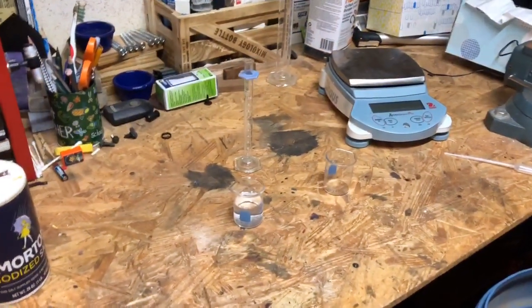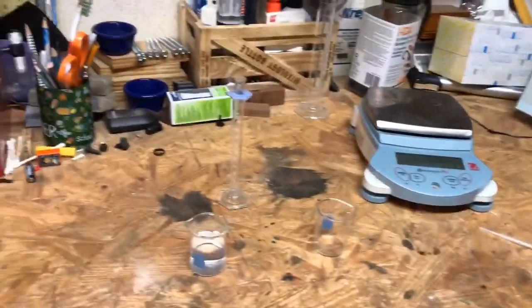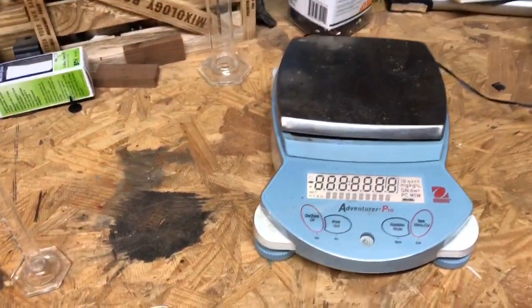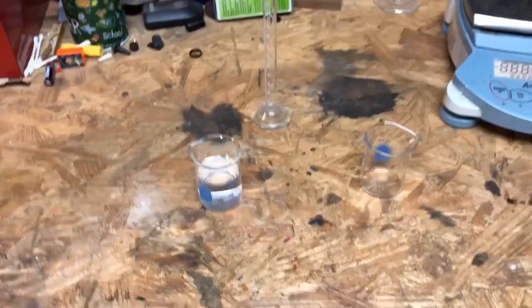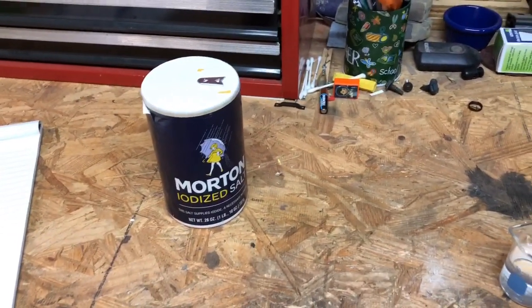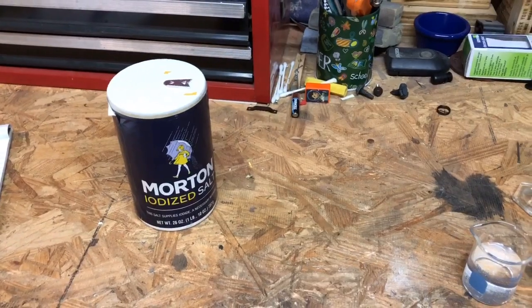So let's take a look at the bench over here and see what we have available to us. All right, so what we have is a few instruments. We have our digital scale today. We're going to turn the digital scale on, get that going for us. We have a couple of beakers, we have a graduated cylinder, and we have some table salt.